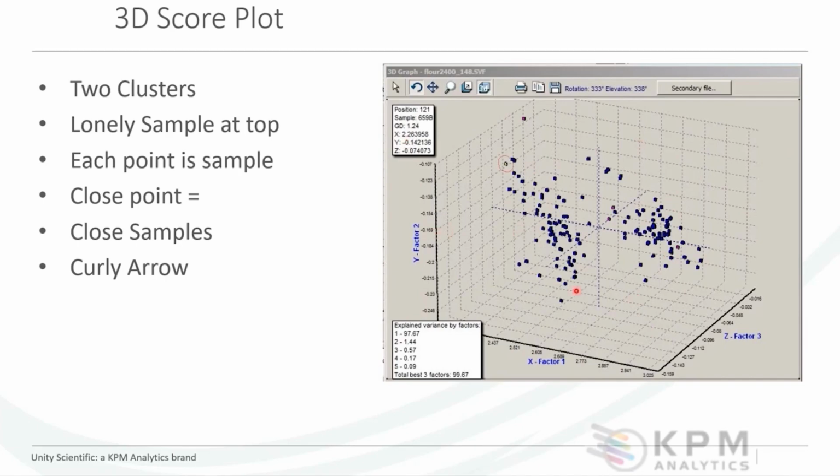Okay. And if you think about it, compared to 10 or so slides back where we had that table, where we saw our features and we saw that we had over 1,000 columns describing our spectra, there's no way that we can evaluate the variance and how our samples relate to each other from a table like that. Well, through feature extraction, through principal component analysis, that same variance is represented here. And it's very easy for us to take a look at this.